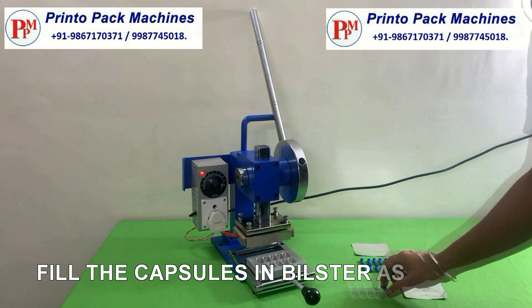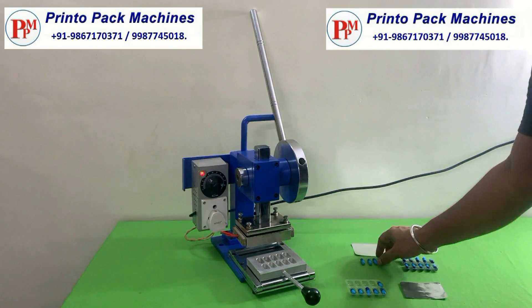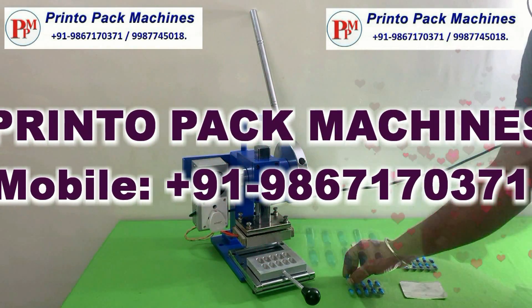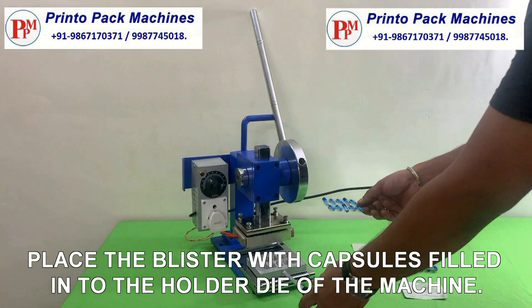Fill the capsules in blister as shown. Place the blister with capsules filled into the holder die of the machine.